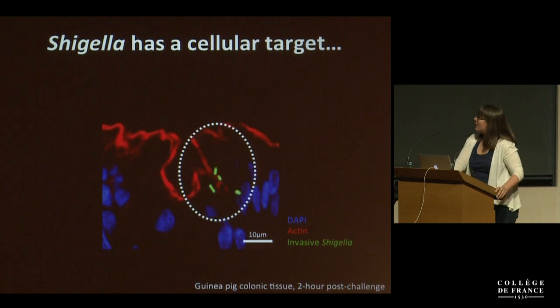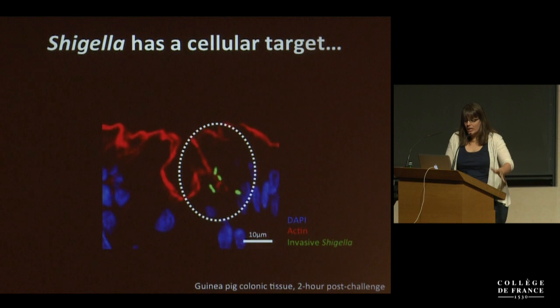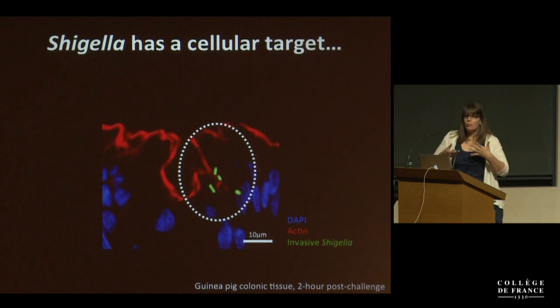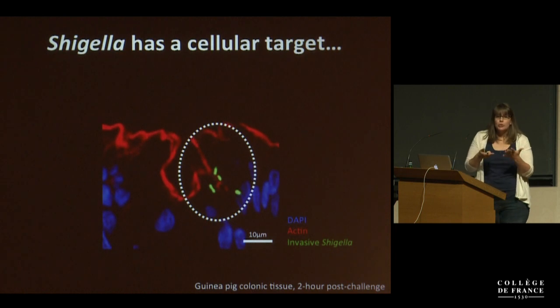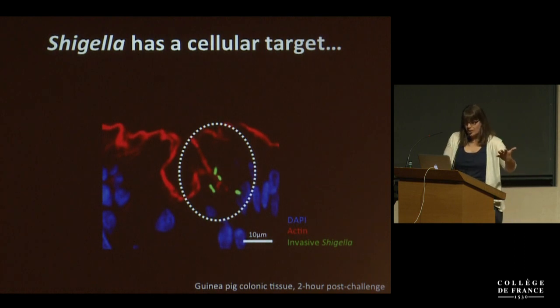But then, if they are being targeted, what is the target in this case? Are they going in through the lumen? Is there a cellular target at the mouth of crypts that they're finding? Given the bacterial depth penetration, the main peak of bacteria at 2 hours was approximately 5 to 7 microns from the surface, and what we measured is the proximity to crypts. It's pointing to an intracellular location within the tissue. So what we've measured so far is excluding a luminal entry. But now we need to identify those cells that were targeted at these crypt mouths.